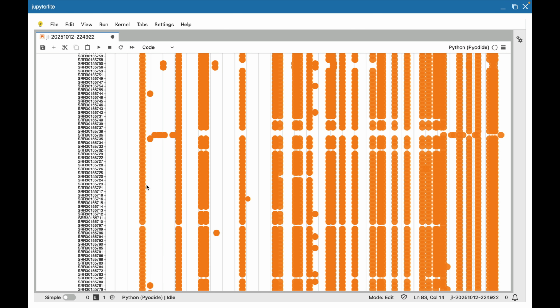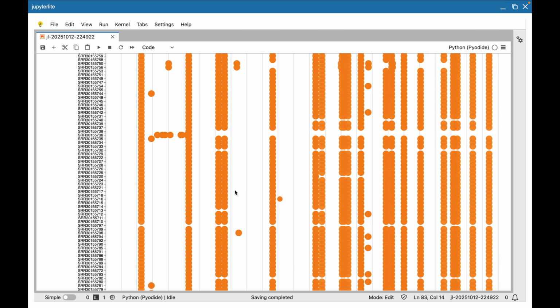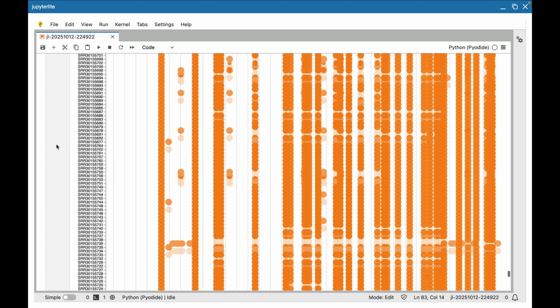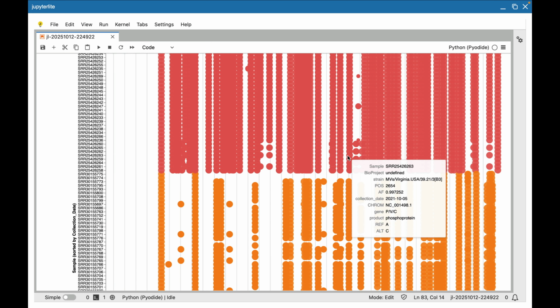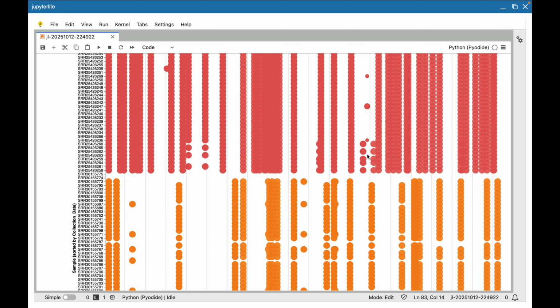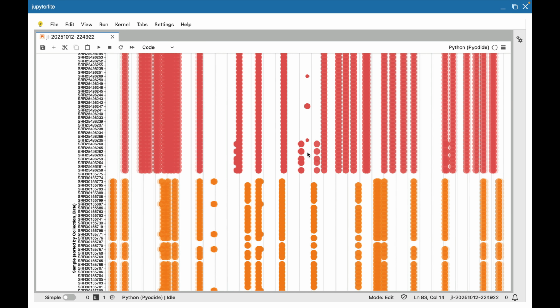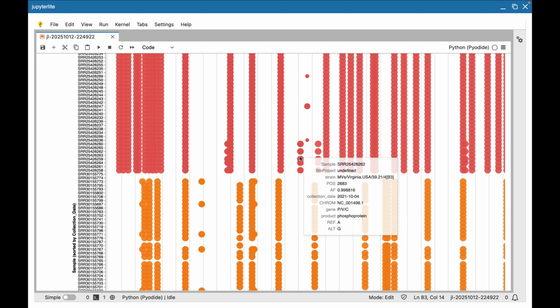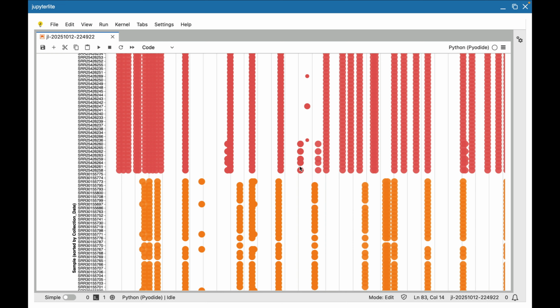They correspond to substitutions which are characteristic of a certain strain that we see here. But we have some interesting substitutions. For example, these changes that affect only 5 American samples are not found anywhere else. This kind of visualization is very helpful for picking up unusual things.